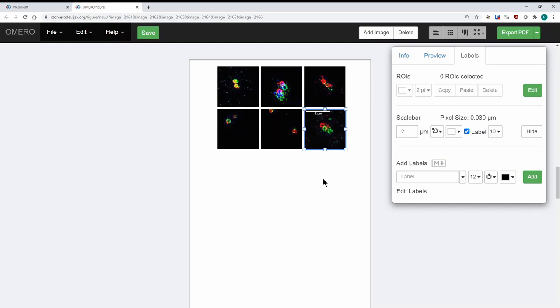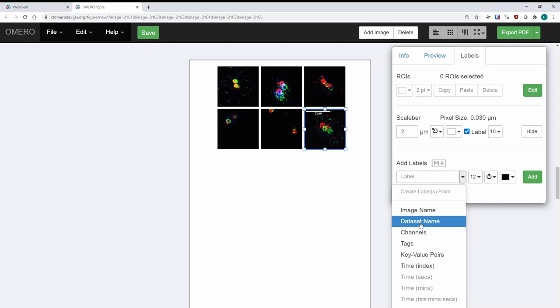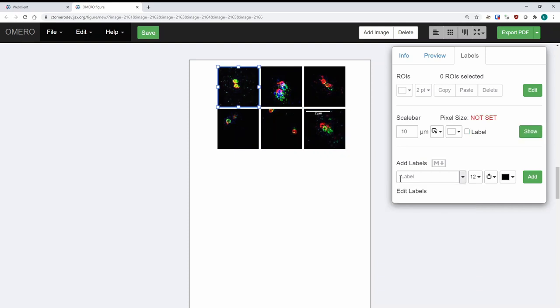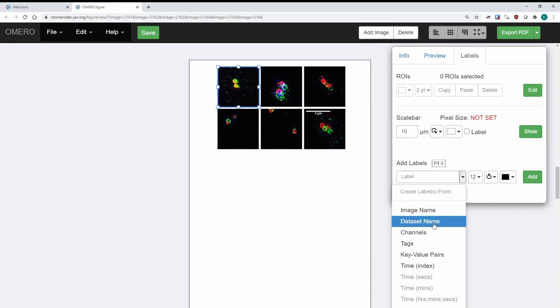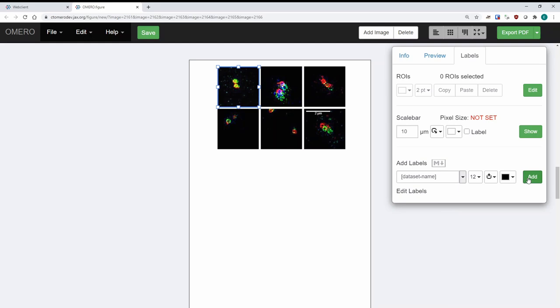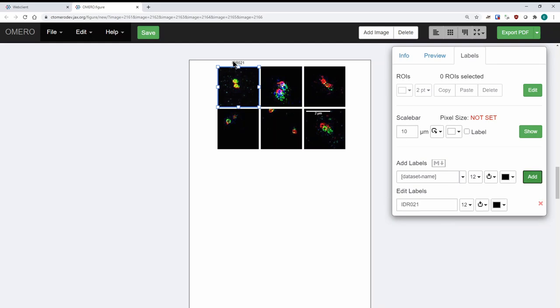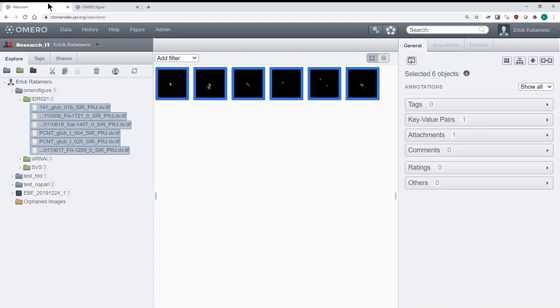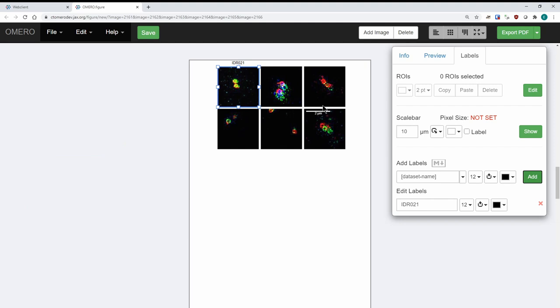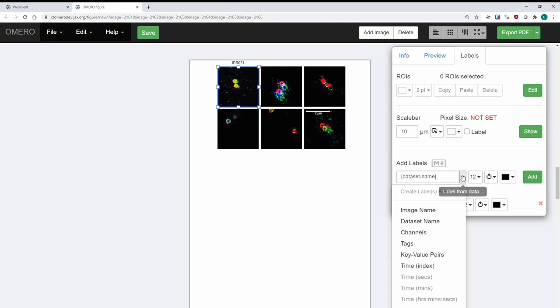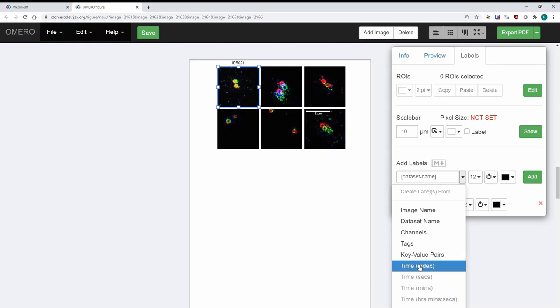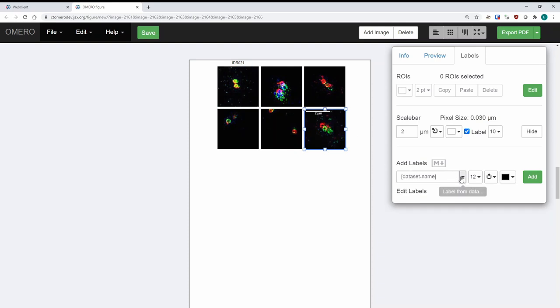There are a few more things you can do in terms of labeling images. You can create labels based on, for example, the dataset name. Let me choose a different image — I'll select 'Dataset Name,' press Add, and it's going to add the dataset name there. If you go back to the main Omero window you're going to see that that's the name of the dataset. So if you have metadata on your images, there's a lot of stuff you can do here — for example, channels, key-value pairs, time, and so on. I will test key-value pairs so you can see.